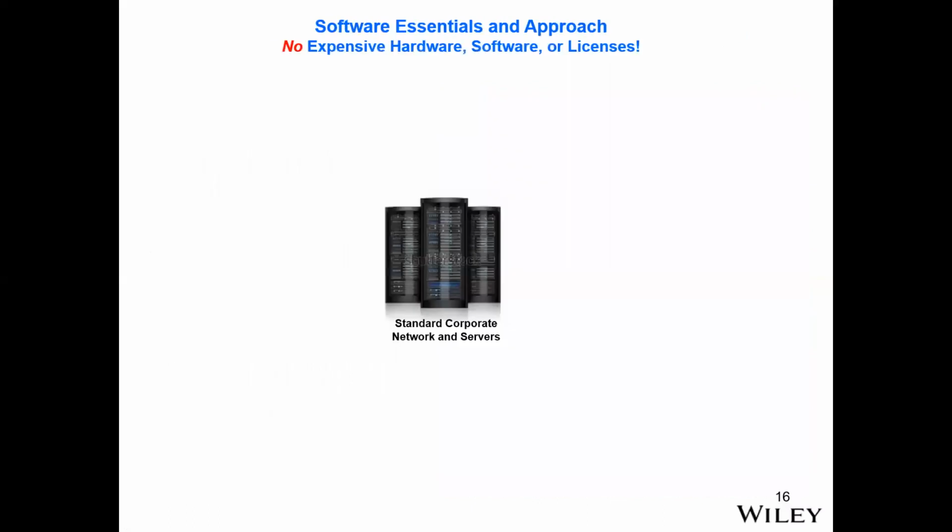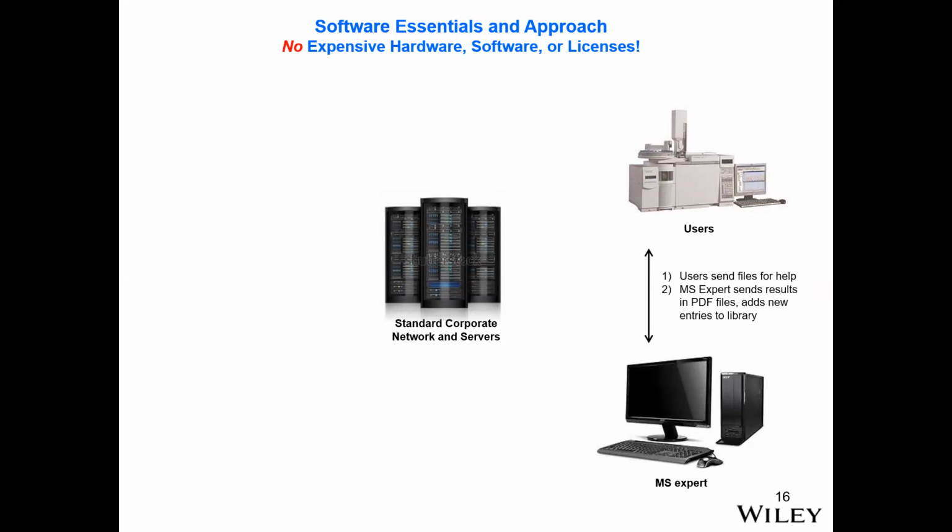So how do you share this database? We have a standard corporate network server system. So just your basic thing, don't pay anything extra for that. We have a lot of users, a lot of MSDs in particular. We also have a limited number of expert mass spec people, but these users can acquire their data and then send the file. If they push the button and don't get the answer, they send it to our experts. They figure out what it is. They send them an annotated file back in email in PDF format, and they add it to the library.